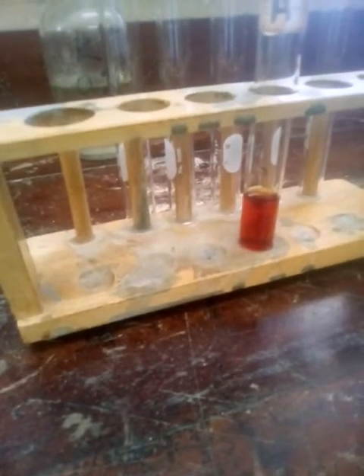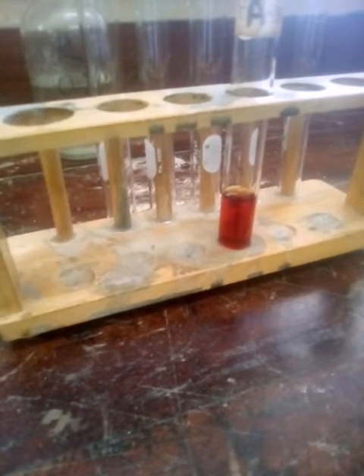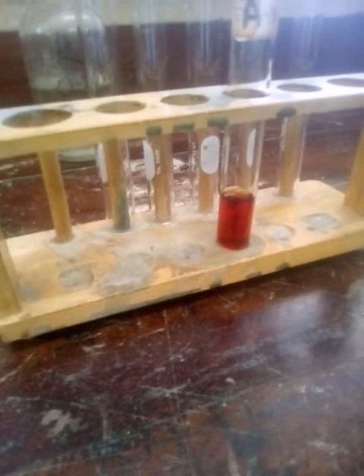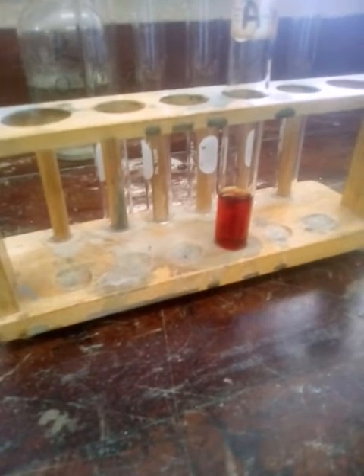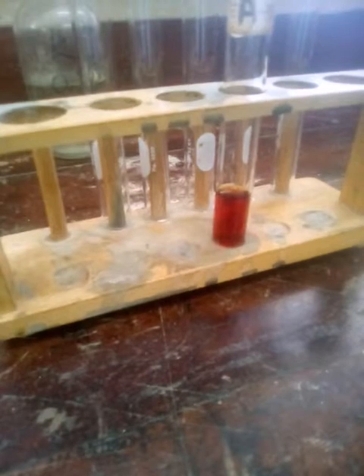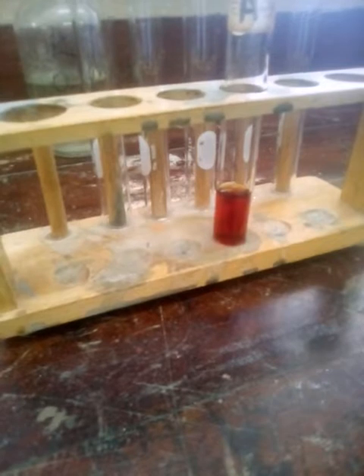This is what we will do in a school setting, so we will not expose the students to concentrated reagents to perform this experiment. This is the end result of a reaction between acidified potassium iodide and hydrogen peroxide.